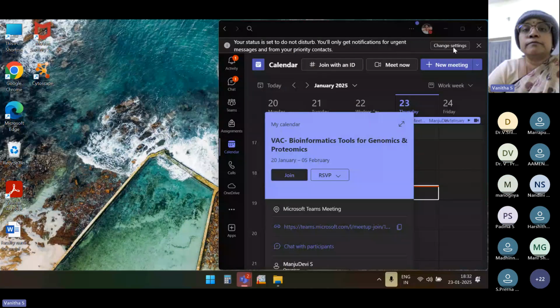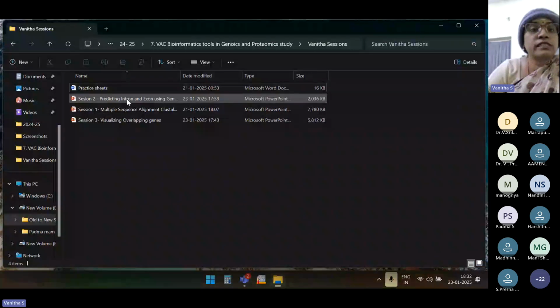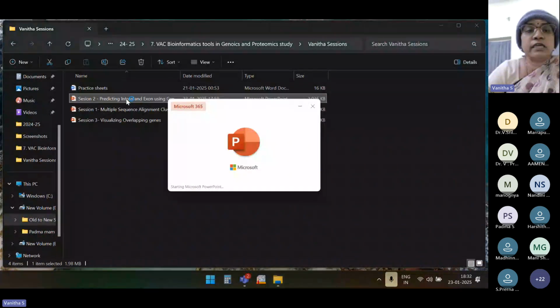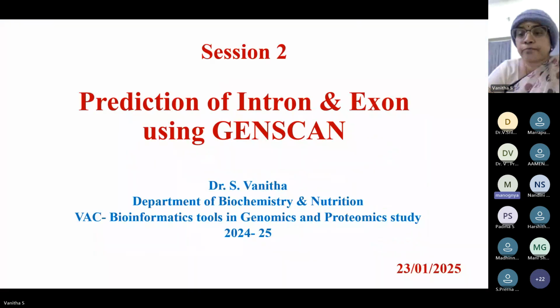To start with, first let me start with gene prediction using Genscan. I hope I am sharing my screen. Are you able to see it? Just say yes and we will start. Is the screen visible? Yes, ma'am. Am I audible? Yes, ma'am, you are. Yeah, thank you so much.